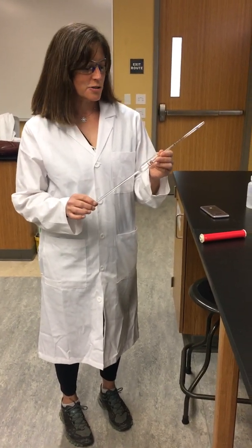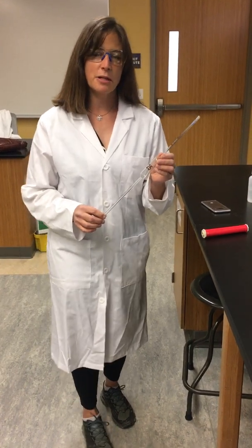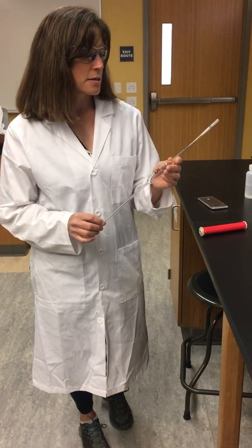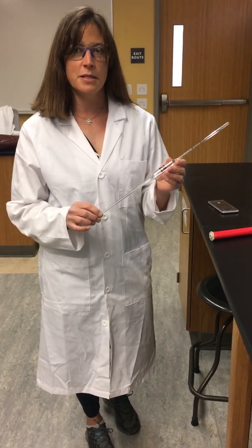All right, so now we're going to introduce what's called a volumetric pipette. A volumetric pipette is another way that we can measure volume, and the level of precision of a volumetric pipette is to two decimal places.